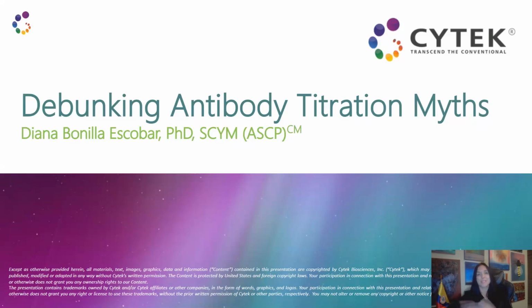This talk is about a simple but relevant topic, antibody titration. We all know how critical antibodies are for flow cytometry, and part of that depends on titration. So the goal for this presentation is to show you how titration is key and also to address some questions and misconceptions around the topic.